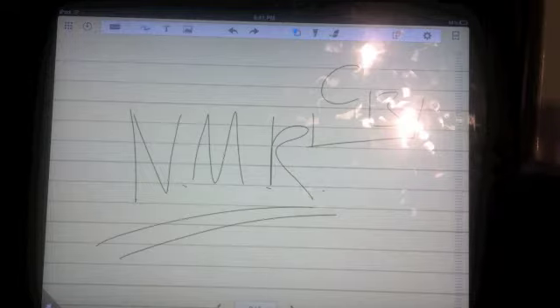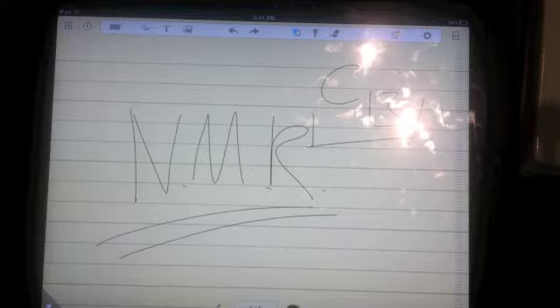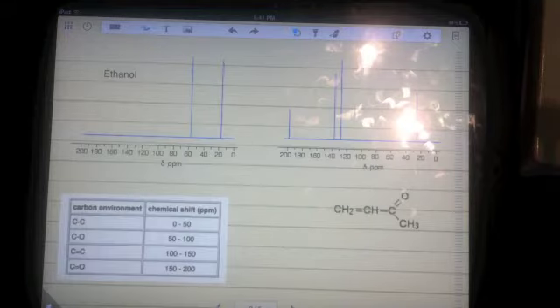Can't be carbon-12 because it's an even number of nuclei, and we need an odd number so we can get that unbalanced spin happening. So anyway, moving on to this. These are spectrums of two different molecules, and we're going to look at why they come up like this and why our spectrums look similar to this. The first one on this side here is ethanol.